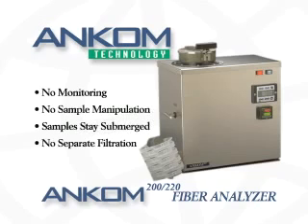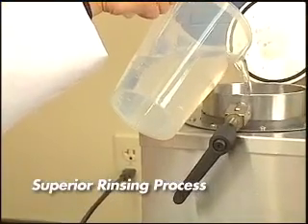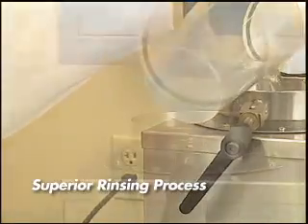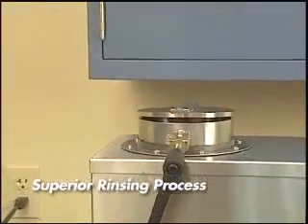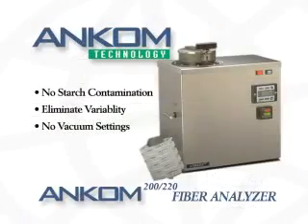Also with filter bag technology, there is no need for a separate filtration step. The process is completed during the rinse steps within the analyzer, so you don't have to worry about starch contamination, technician variability in setting the filtration vacuum, or other problems inherent in the more manual methods.